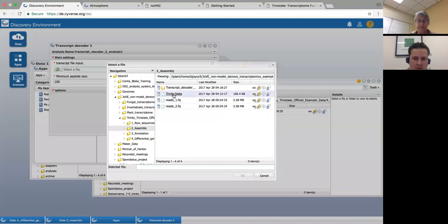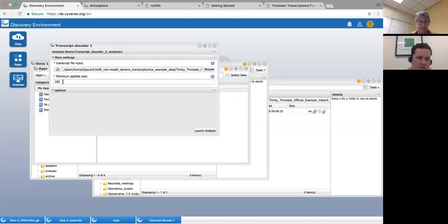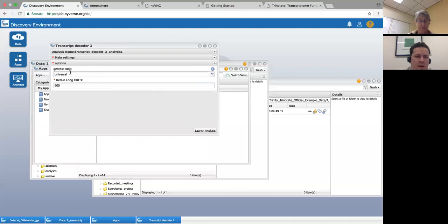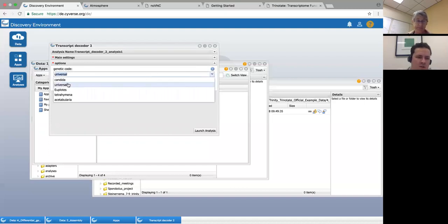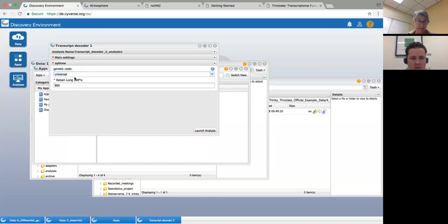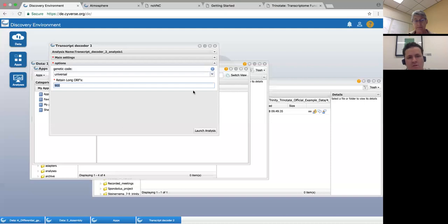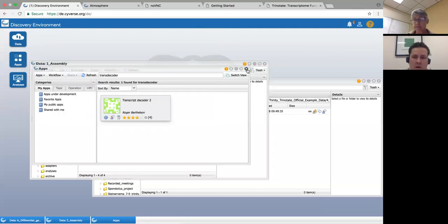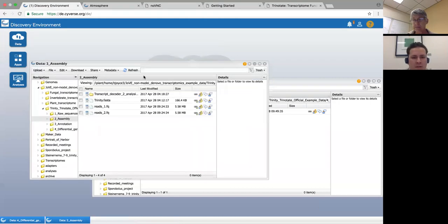All you have to do is input that assembly. Here's our assembly. This is the default minimum peptide size — if you're interested in really small peptides you could change that. Generally for secondary metabolism and metabolism genes there are very few less than 100 peptides, so I usually leave that. You can also change the genetic code used — there's a universal code and a few others if you're working with species outside that. Then you just launch the analysis. It'll return all of the peptides, all the open reading frames and all the peptides associated with that.